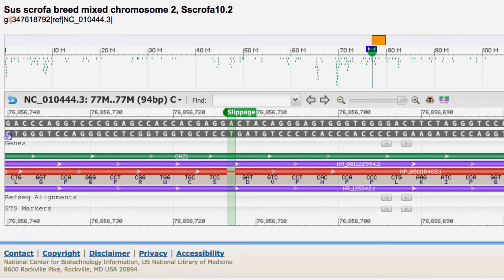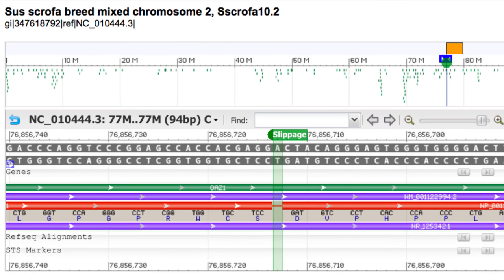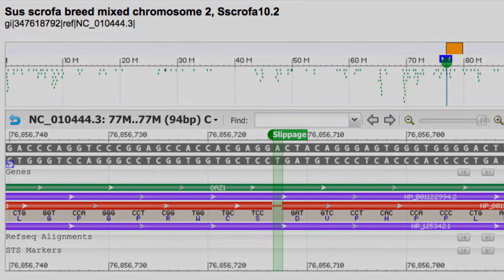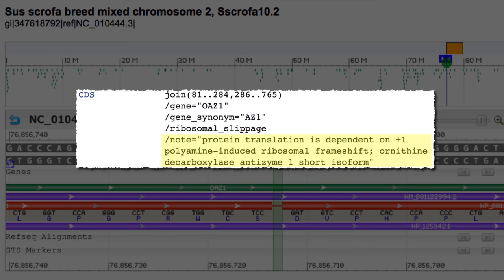A second example comes from chromosome 2 of the same assembly. Here you see insertion of a one base pair gap, which is necessary to avoid the TGA stop codon. Like the other discrepancies, this slippage is displayed because we take information from feature notes in the RefSeq records. In this case, the note said that protein translation is dependent on a plus-one polyamine-induced ribosomal frameshift.